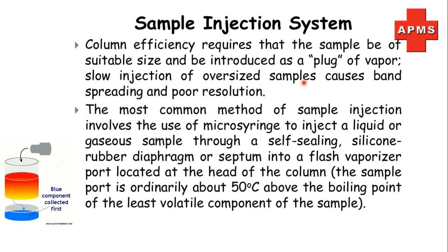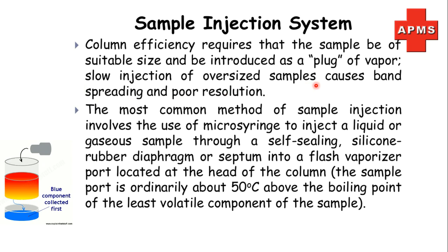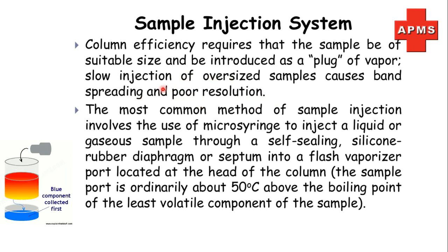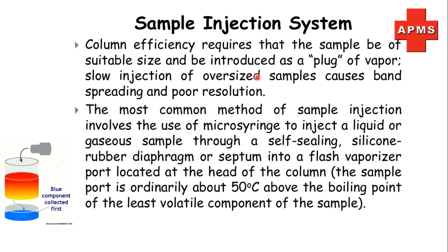Slow injection of oversized samples causes band spreading or poor resolution. Oversized samples mean samples with a higher amount of analyte. If we introduce these samples slowly, they spread inside the column as a band and will not separate completely, giving poor resolution. Due to this poor resolution, components will not be completely separated inside the column, and we will not get clearly resolved peaks at the detector — resulting in less precise and less accurate results.